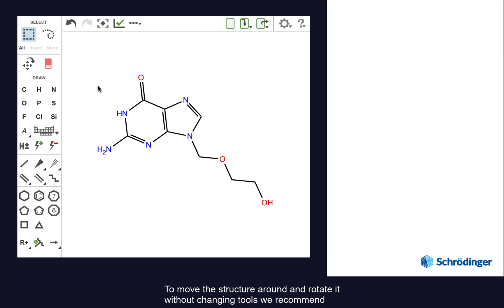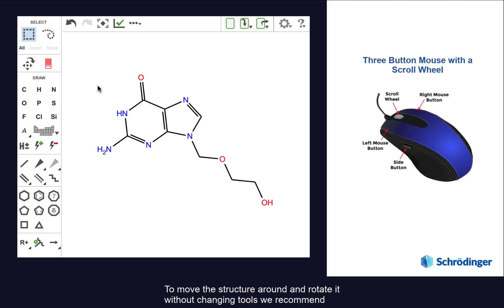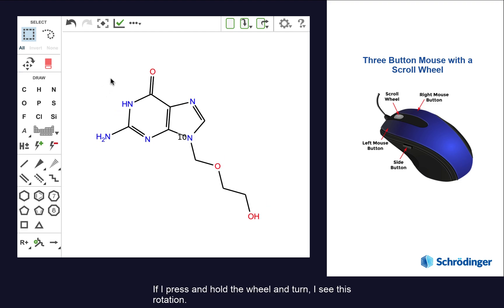To move the structure around and rotate it without changing tools, we recommend using a three-button mouse with a scroll wheel. If I press and hold the wheel and turn, I see this rotation.